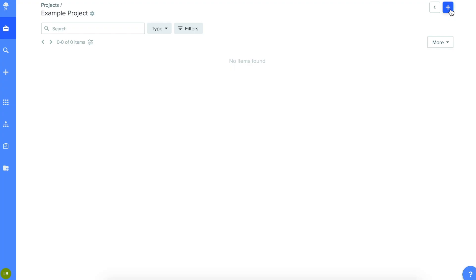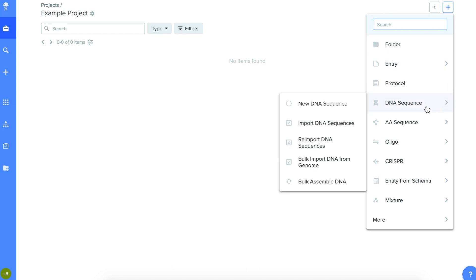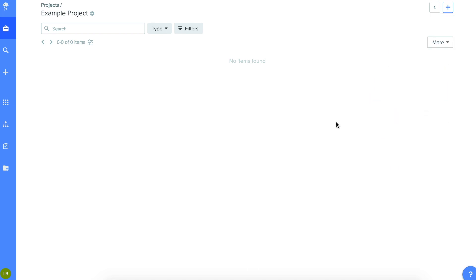Click the plus sign in the upper right hand corner, select DNA sequence, then import new sequence.